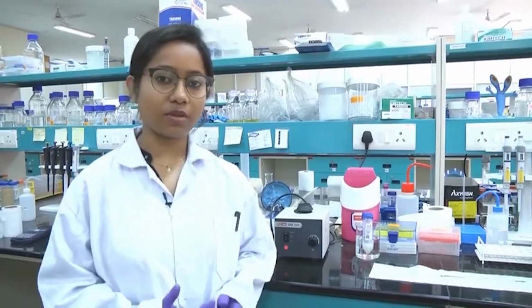Welcome back. Today in the NPTEL experimental biochemistry course we will learn how to isolate and characterize protein. If you are working in a biochemistry lab, you might find that you need some protein for your own experiment, and today we will learn how to isolate that particular protein. For today's experiment we will go through the basic steps of protein purification from a source.